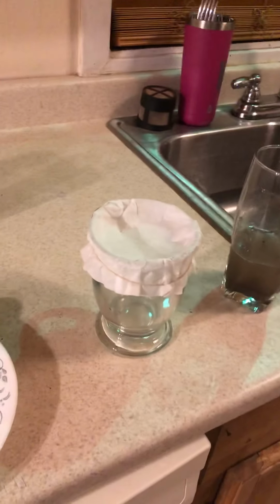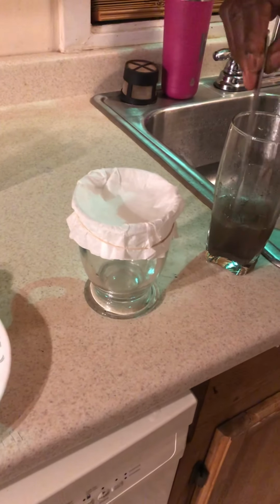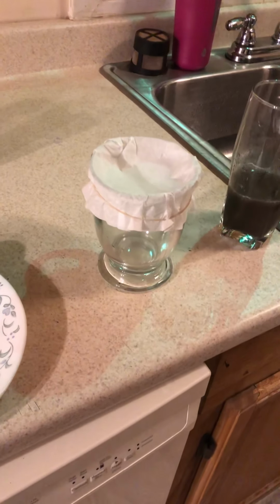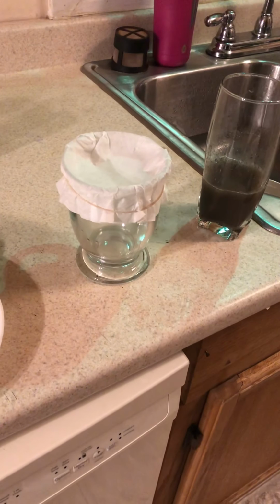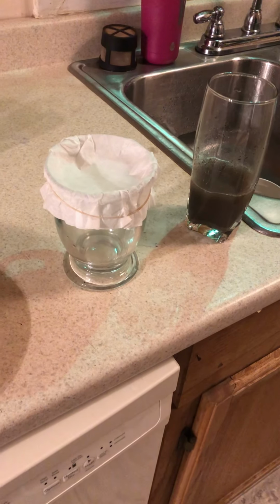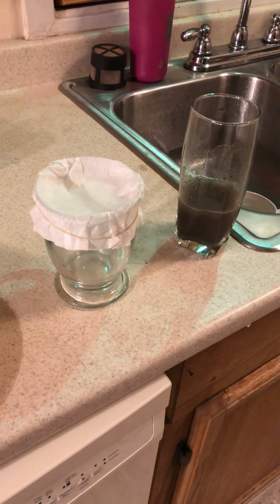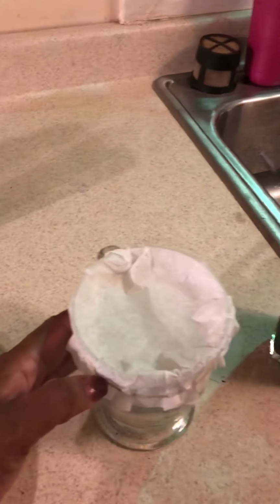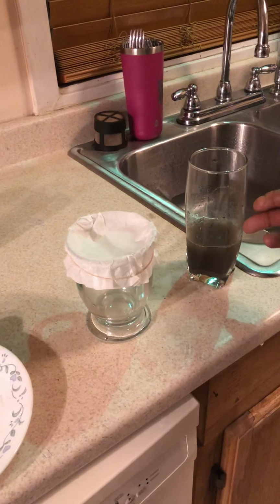Okay. Another type of mixture that we are going to separate, we'll be separating it using filtration. This is another one of those demonstrations that we'll have to come back and look at a little bit later on. So we're using a coffee filter, and we mixed up some soil and water.